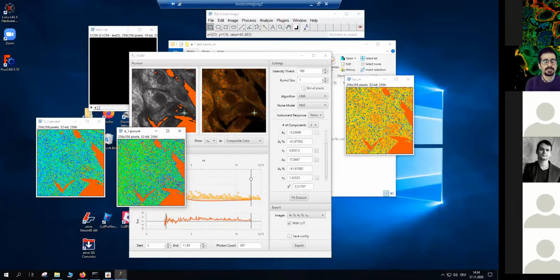This is what also Amasi, Priyasami, and Holzwa have. That's the team that presented, and they have done some kind of segmentation to find out the mitochondria, and then addressing the NADH and metabolism changes in the mitochondria and so on. So what I'm saying is that these tools in Fiji, in combination with all the other plugins and possibilities that Fiji is offering, would be very handy if you want to do a second and third level of analysis with your data, not only exporting lifetime in your field of view or specific changes in the fractions, but measurements correlating the lifetime with the intensity changes, or correlating the lifetime with different compartments in your sample and so on. So that was it, a kind of demonstration.